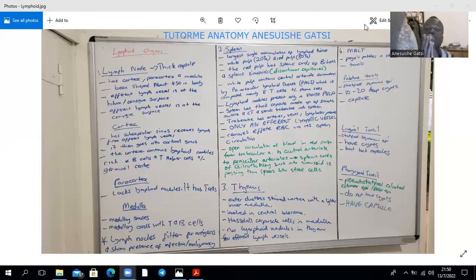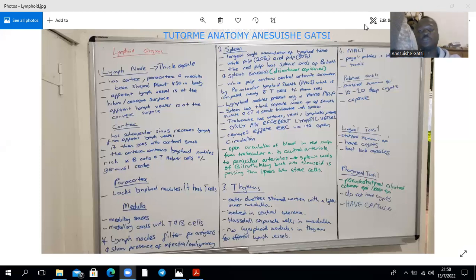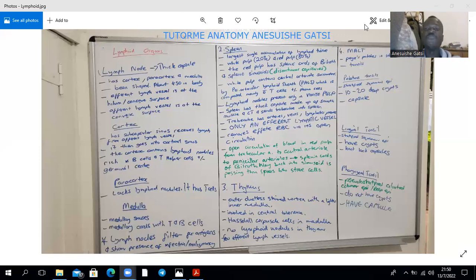The capsule of the spleen is quite thick. It's made up of smooth muscle and connective tissue, and that capsule sends trabeculae within the spleen. Within the trabeculae, you have arteries, veins, lymphatics, and nerves. The spleen only has an efferent lymphatic vessel that leaves it, without an afferent.